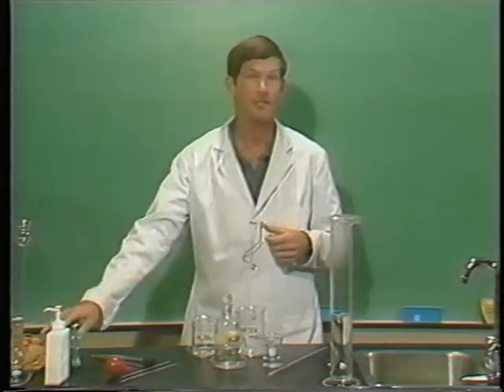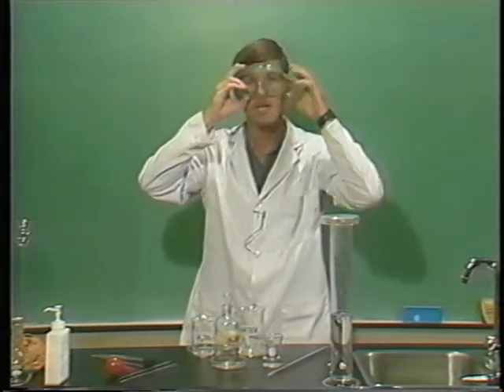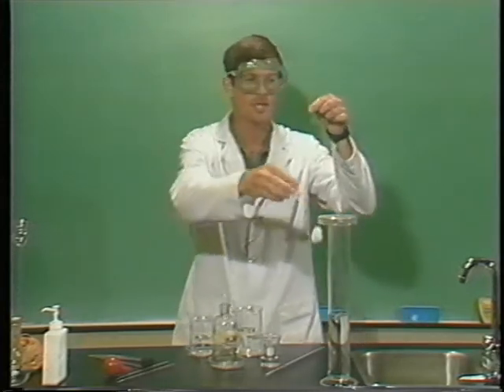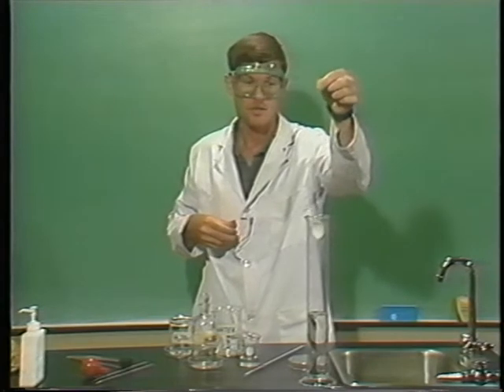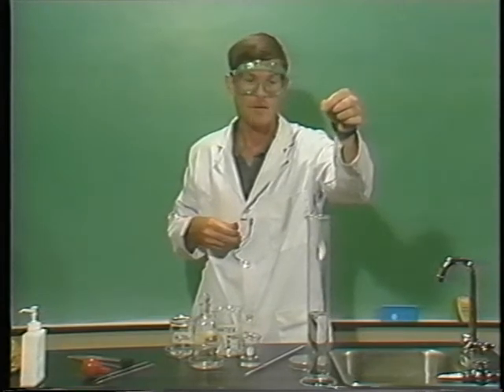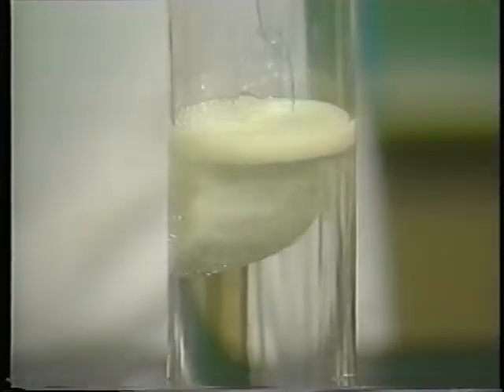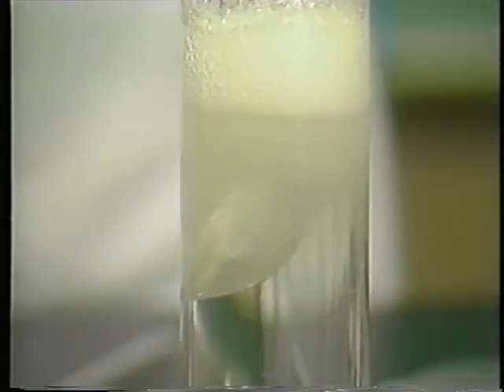Now, one final demonstration to emphasize just how dangerous acids can be. In this cylinder, I have some very concentrated acid. What I'm going to do is lower this seashell into it. Now, seashells are made of pretty much the same material that your teeth are made of, so you can see what happens when this seashell touches the acid. We see a chemical change starts to take place right away. We know this because there's a gas produced.